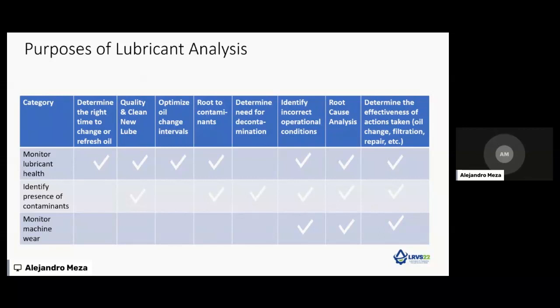The next one is root cause analysis. We can run advanced oil analysis or advanced grease analysis whenever we have had a failure and we want to research what was or what were the failure modes happening there. Normally, root cause analysis is more complex. It typically runs specific tests according to the information we want to get. And it requires many times a bigger sample, and we need to take the sediments or things like that to bring useful information to the laboratory to investigate what happened.